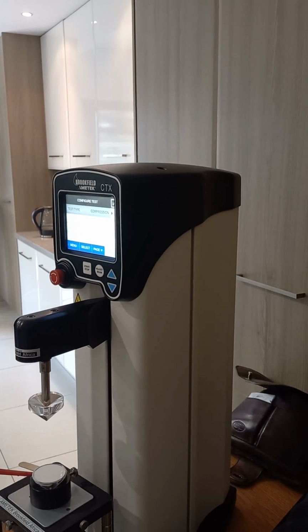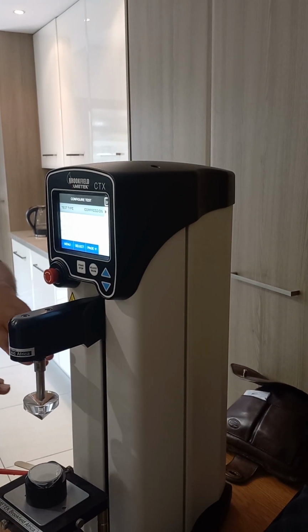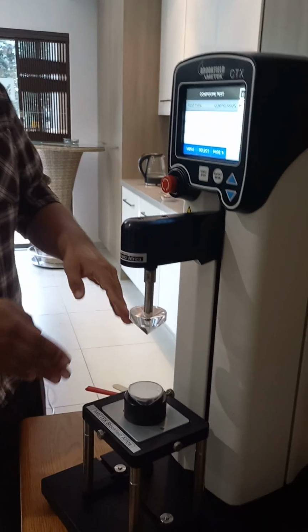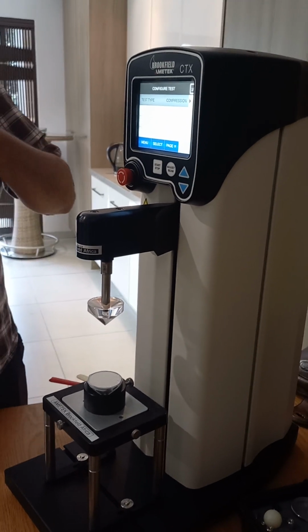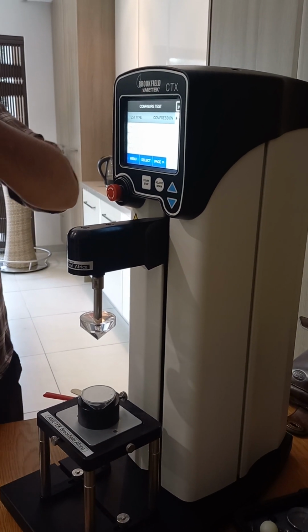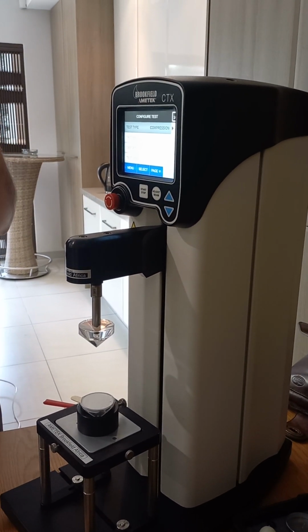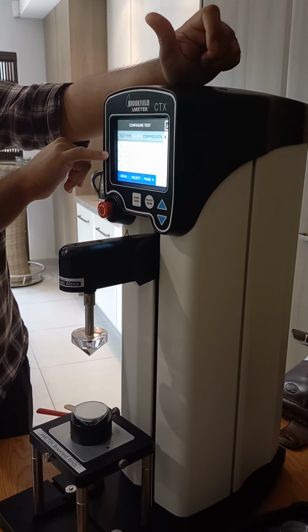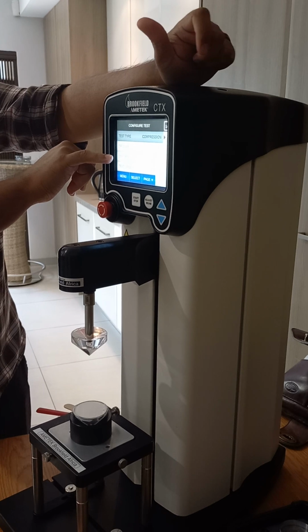So what that means is the probe will move downwards towards the sample. When it senses a force value of greater than 2 grams, it automatically starts its analysis. It will then analyze and move a length defined by a deformation value.